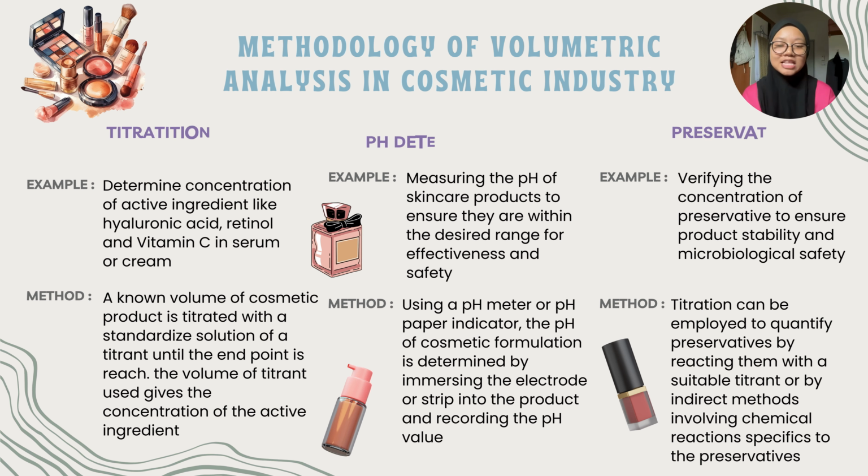Next part, I would like to explain about the methodology of volumetric analysis in cosmetic industry. The first one is titration for active ingredient. For example, determine concentration of active ingredient like hyaluronic acid, retinol, and vitamin C in serum or cream. The method is a known volume of cosmetic product is titrated with a standardized solution of a titrant until the endpoint is reached. The volume of titrant used gives the concentration of the active ingredient.